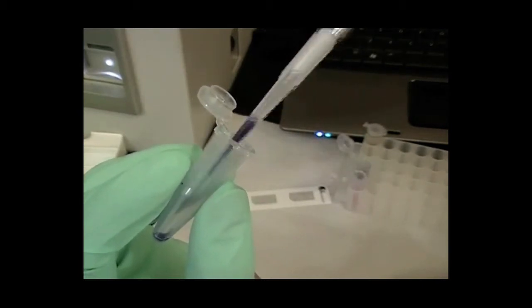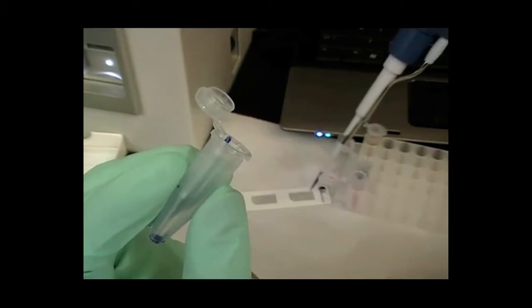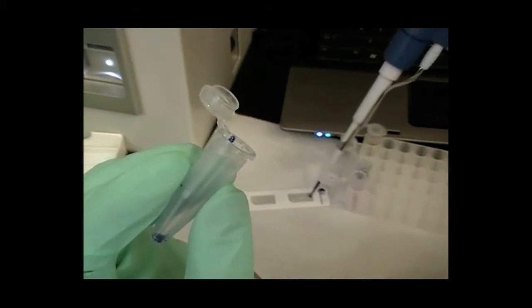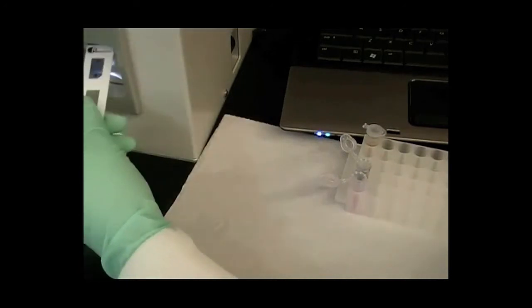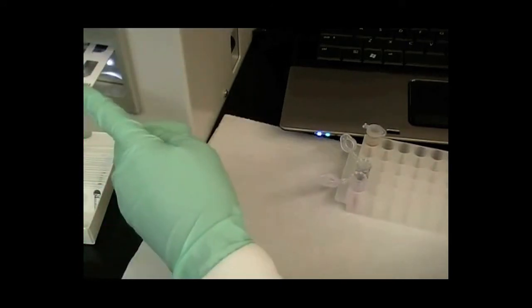Twenty microliters of sample is pipetted into a cellometer counting chamber and allowed to settle for one minute. The chamber is then inserted into the Cellometer Auto T4 cell counter.